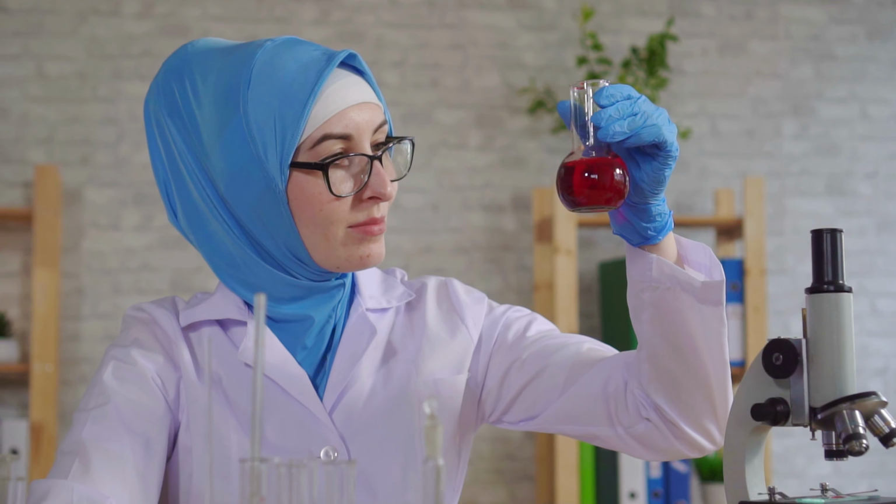Now, you might be asked to draw a labelled diagram of this process, so we'll just go over those key parts. The equipment is a funnel, sometimes called a filter funnel, the filter paper, and the conical flask. You might add a beaker for holding the original mixture, but otherwise all we have to do is label the starting mixture, the residue caught in the filter paper, and the filtrate that's passed through it.